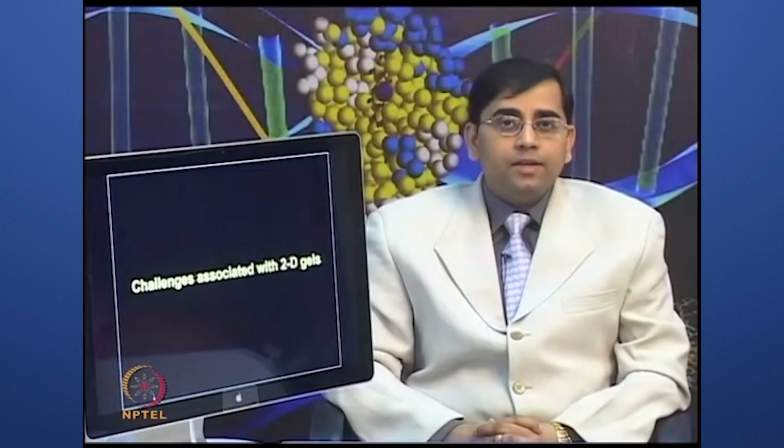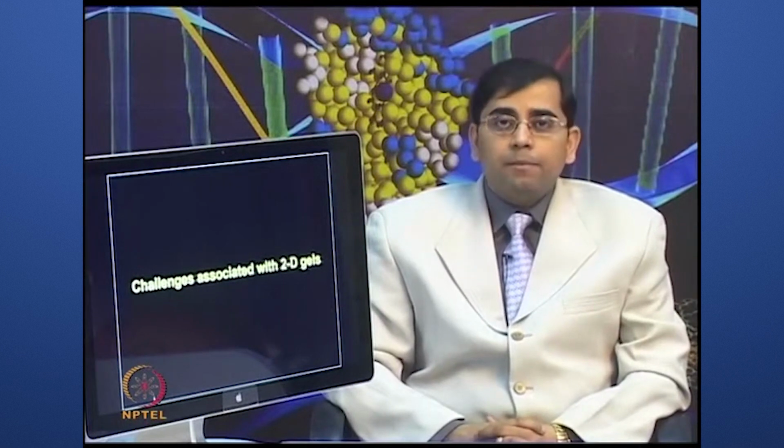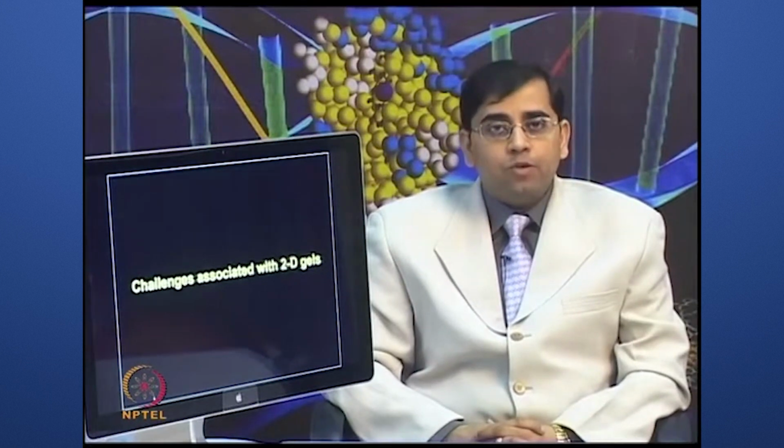today I have invited a guest here to discuss image processing and data analysis using commercial software. So, today we will have Dr. Srinivas from GE Healthcare, who will discuss how to analyze gels by using ImageMaster Platinum software.